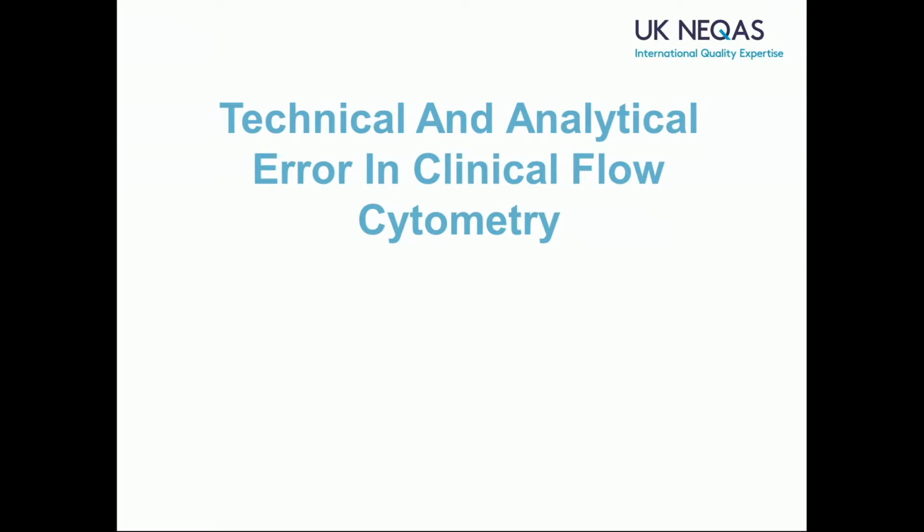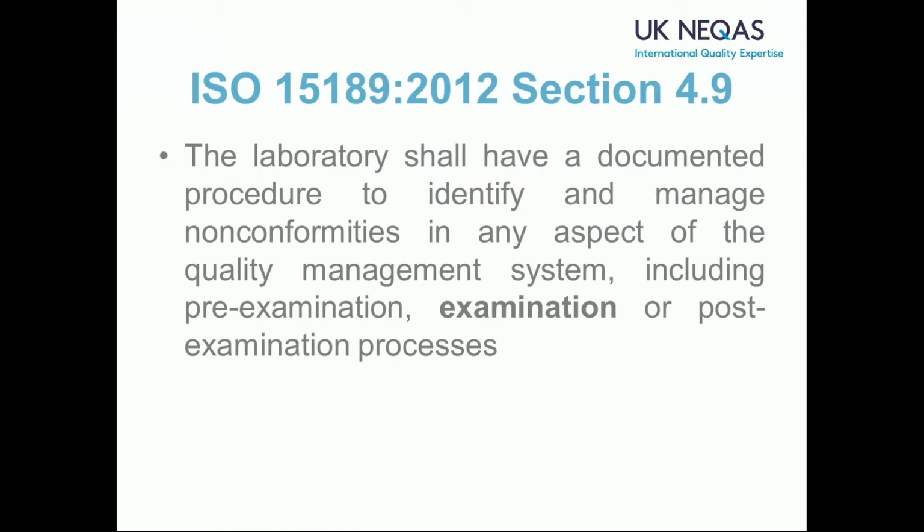Anyway, technical and analytical error in clinical flow cytometry. As with Alison, I'll say apologies to anybody in Thessaloniki, I did talk a lot about some of this stuff whilst I was over there. ISO 15189: laboratories shall have a documented process to identify and manage non-conformities in any aspect of the system, pre-examination, examination, or post-examination.